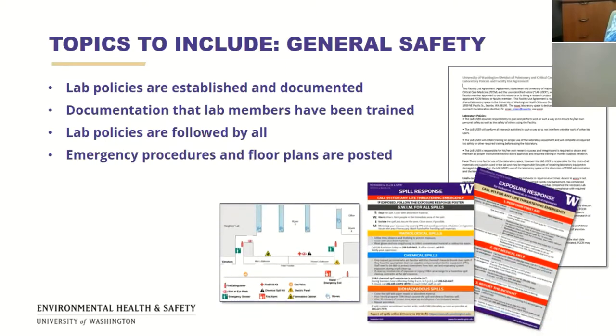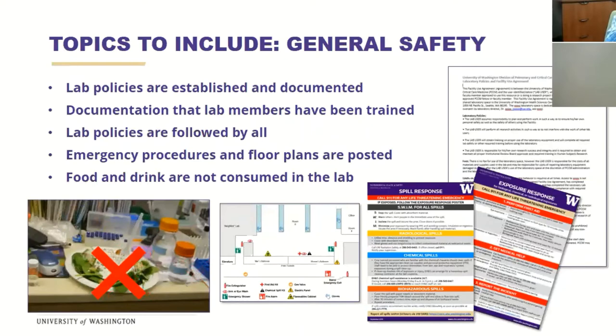Emergency procedures and floor plans should be posted in all your workspaces. And food and drink should never be consumed in the lab.